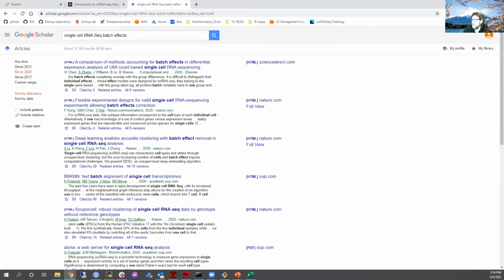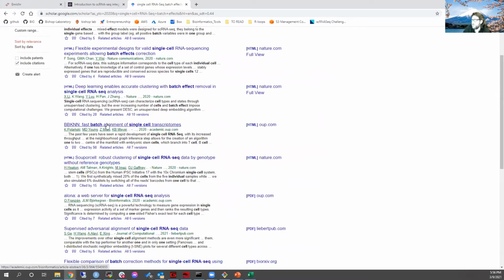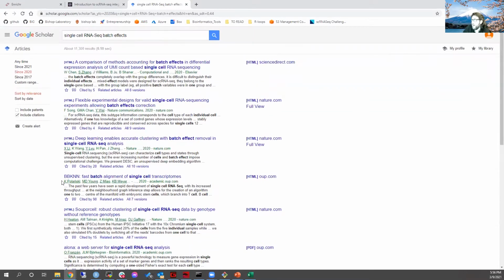So we'll do since 2020. This is one I've heard a lot of people using, BBKNN. And there's just really so many of them out there at this point.